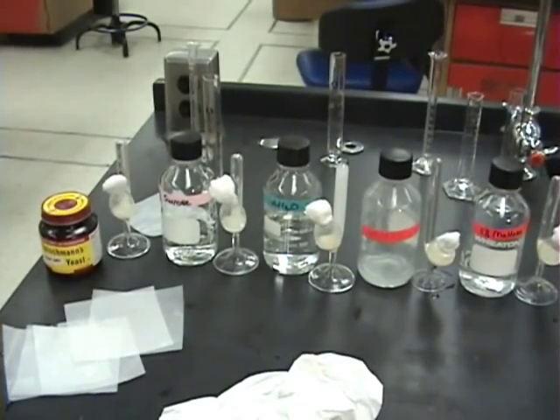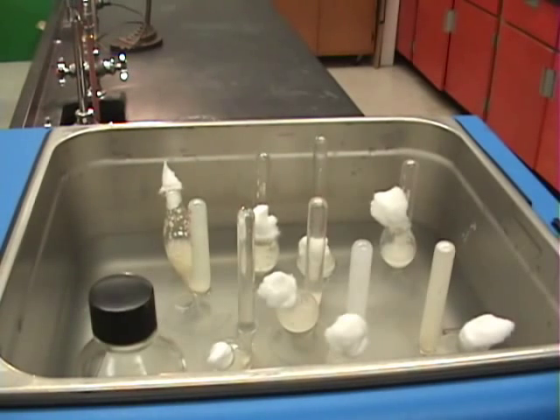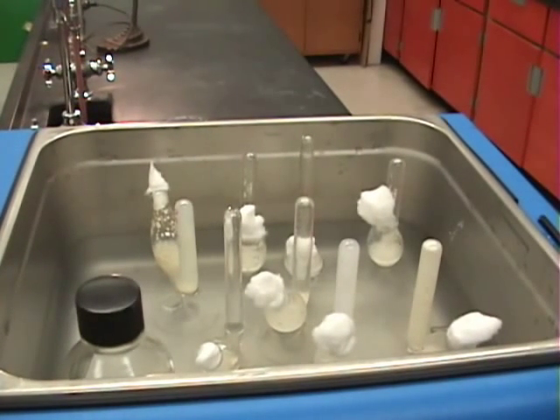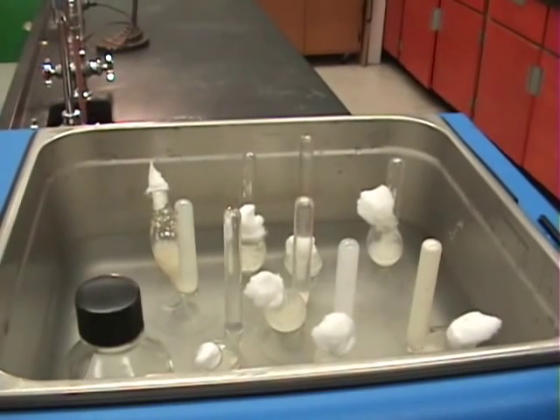Now they'll be put in the hot water bath for approximately 30 minutes. You can see the various yeast solutions in their hot water bath, which is set at 37 degrees Celsius. The yeast will be allowed to attempt their fermentation during this 30-minute run.